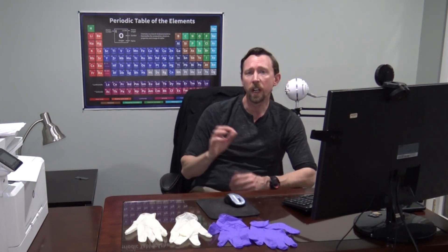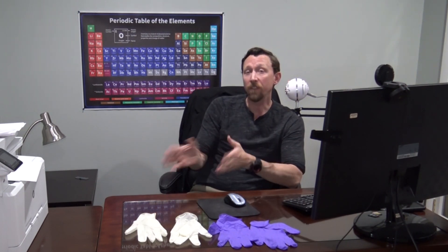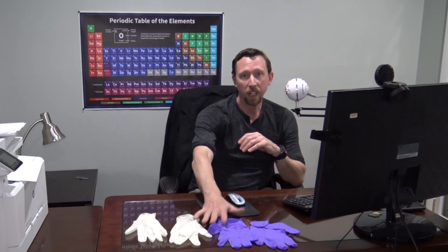So that got me thinking: using a protective glove is not necessarily a bad idea when you're out in public, but the gloves are only as good as the technique that you use and the thought that you put into it while you're wearing them. Today I'm going to give you a quick talk about how we protect ourselves in a lab, but everything translates perfectly into how you might protect yourself in a grocery store using these protective gloves.